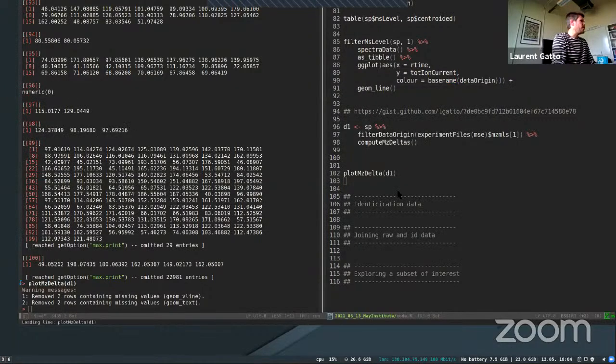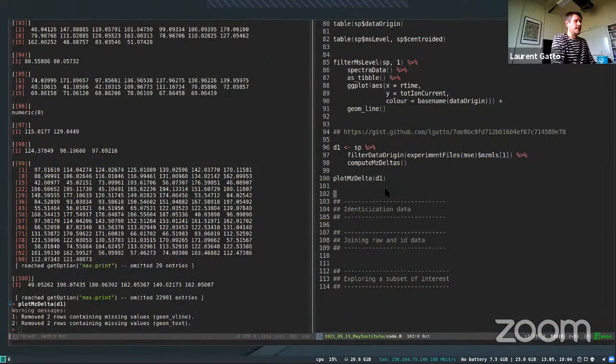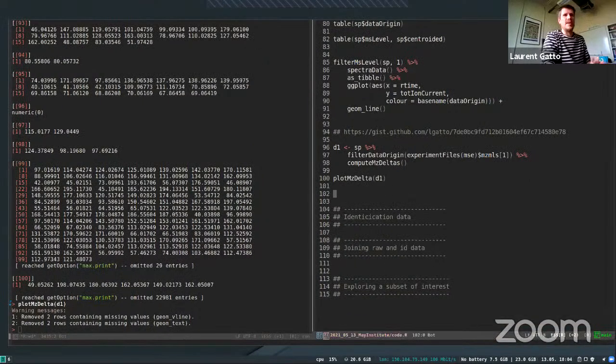And so that's another type of quality control that I find really useful and that I tend to do, especially when I don't quite get the number of identifications that I'm supposed to get. It's always good to try to have a, let's say, search engine independent quality control.